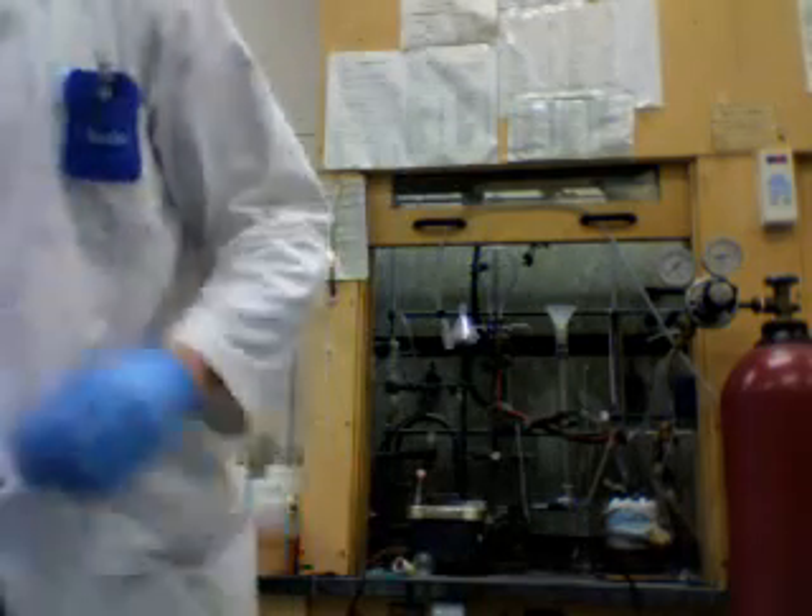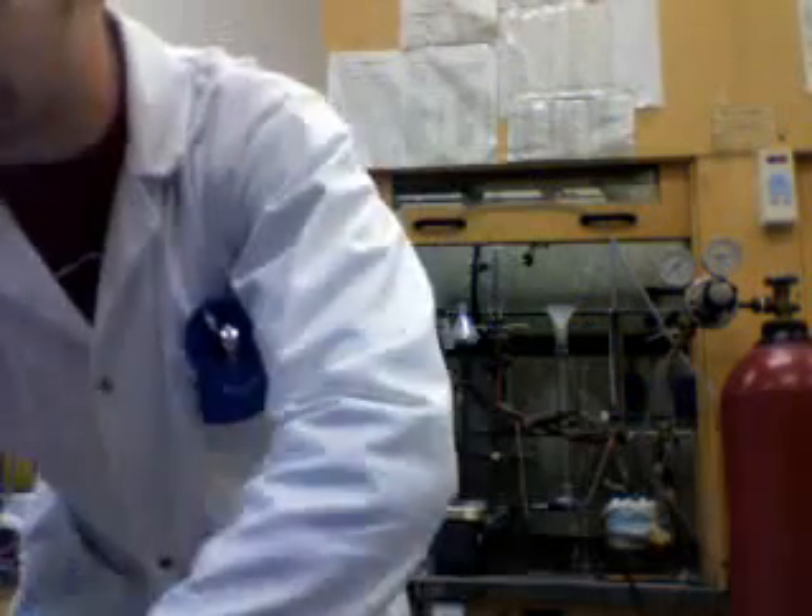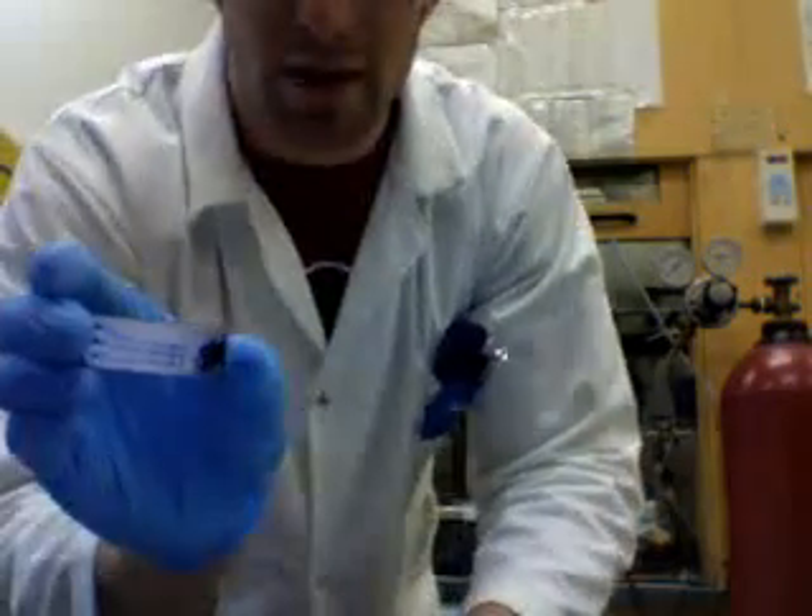After you spot the TLC plate which contains the same material, you use a special revealer and you can see where your product is coming in.